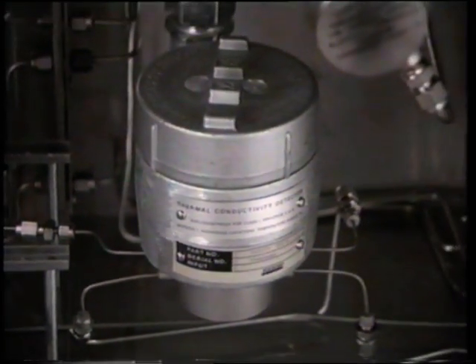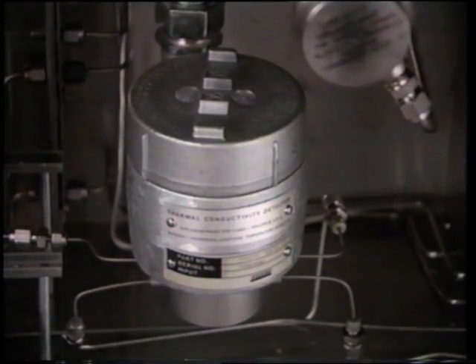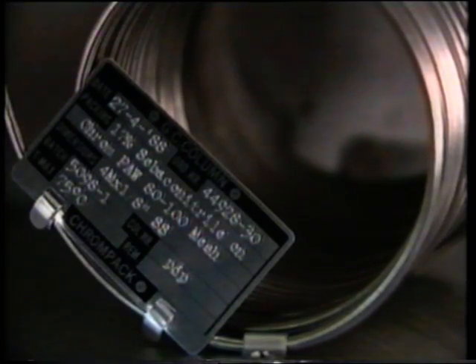The flow of carrier gas must be sufficient to transport the sample through the columns and to flush or purge the columns to remove old samples and any undesirable components. Flow rate is dependent on the specific application. Higher pressures may be required for flow through longer columns.